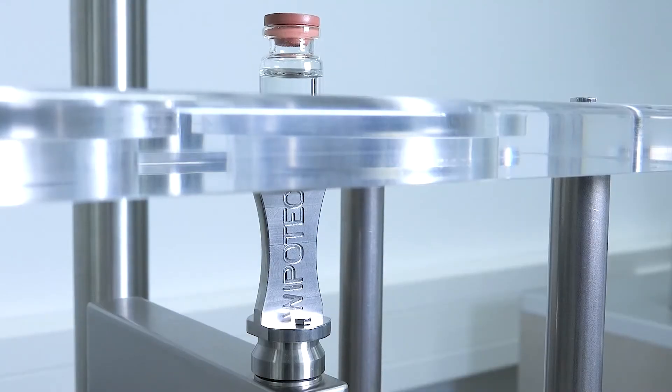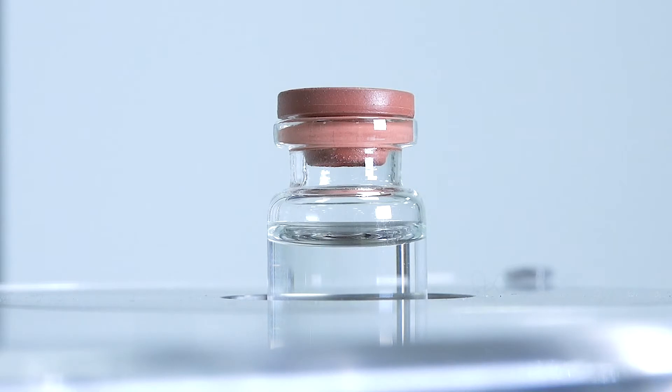We have weigh cells and solutions for your filling process in pharmaceutical environments, and in particular when we're talking about vials. Here we see a solution to an answer I receive very often from mechanical engineers and machine builders: yes, cylindrical vials can be lifted up for weighing — it is possible.